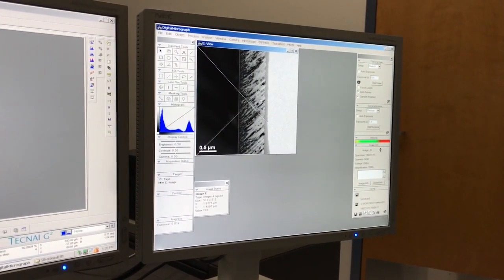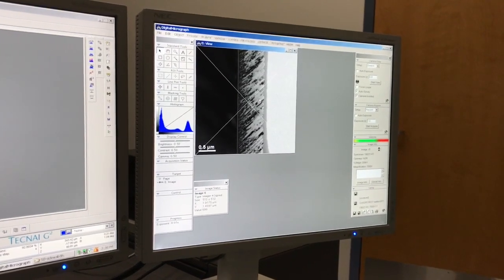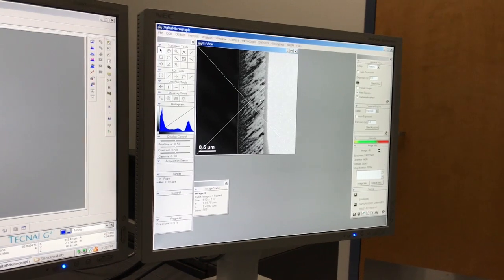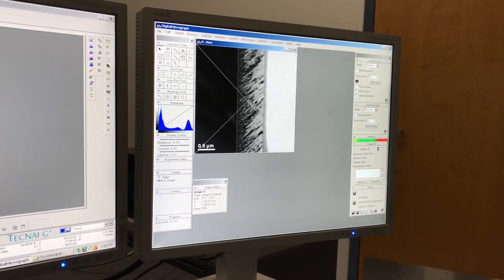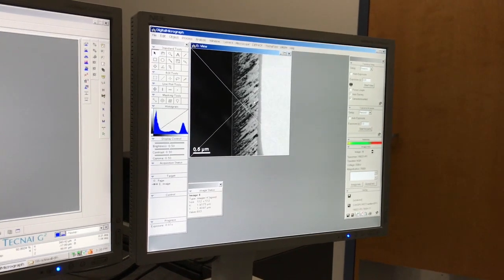The topic of this video is going to be selected area diffraction, and specifically what is selected area diffraction and how do we record selected area diffraction patterns.